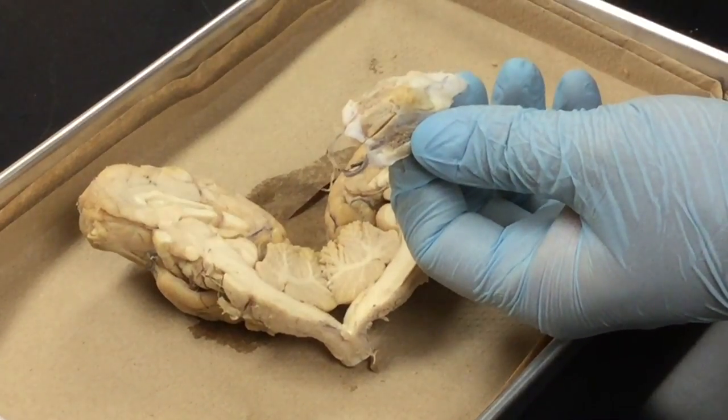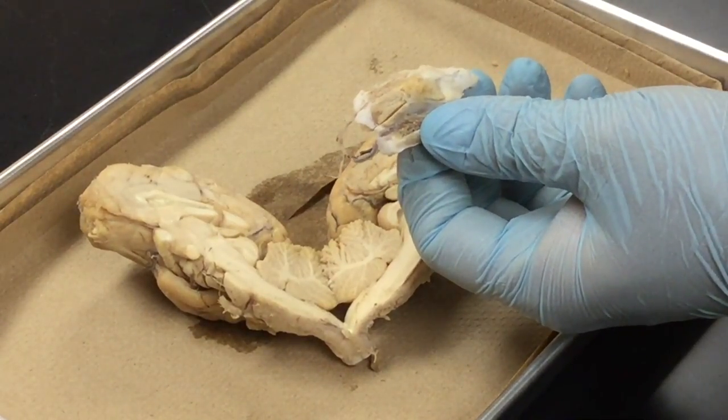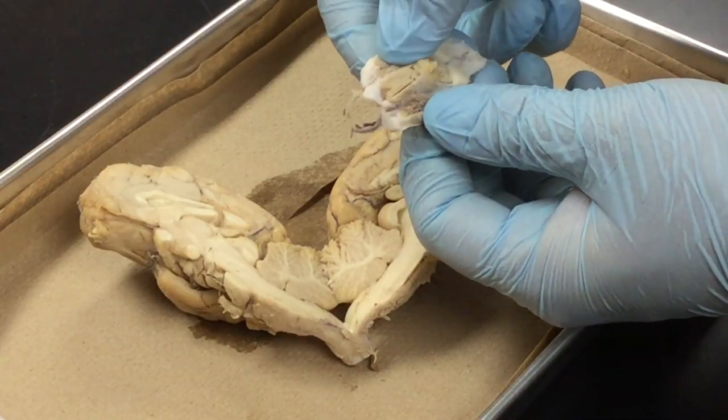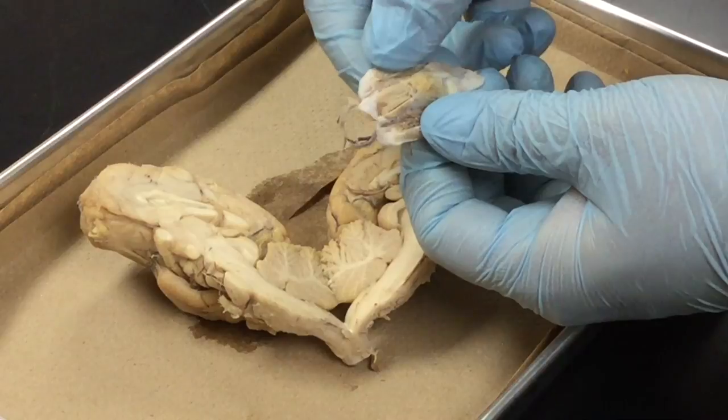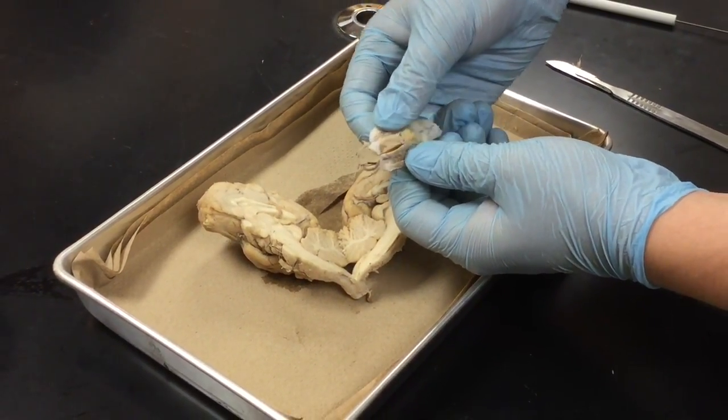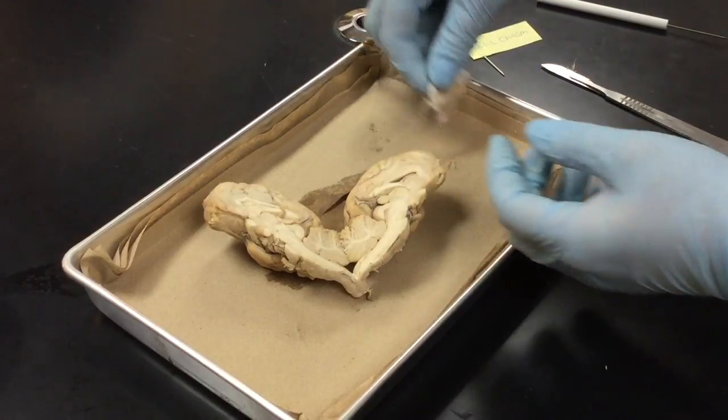So the pituitary gland helps in maintaining hormone balances within our body. If that area gives you a little bit of difficulty as you are trying to make your incision into your brain, make sure you ask for help to get it fully removed.